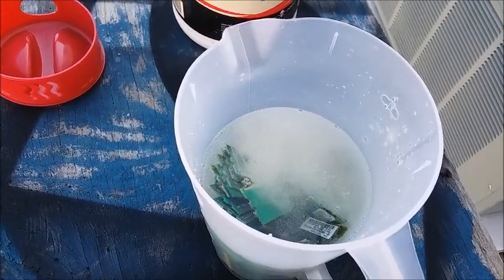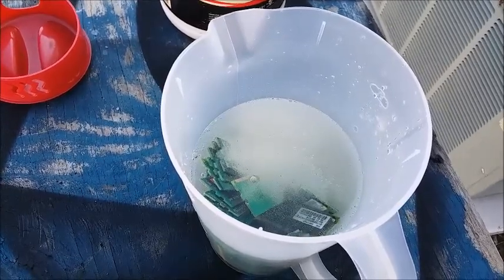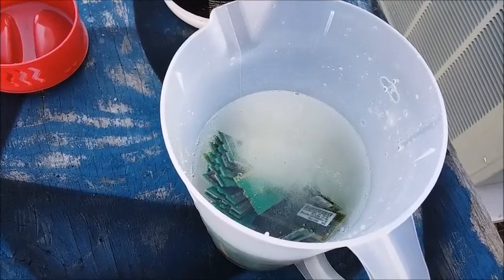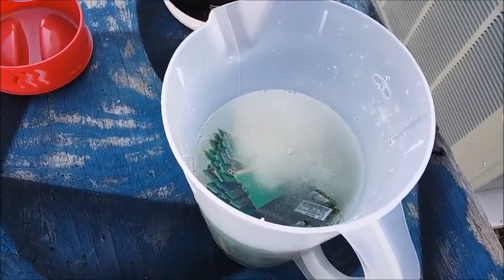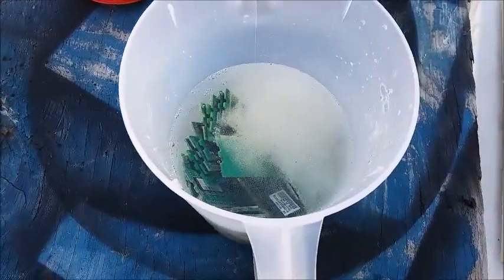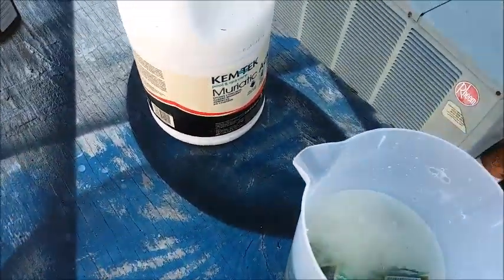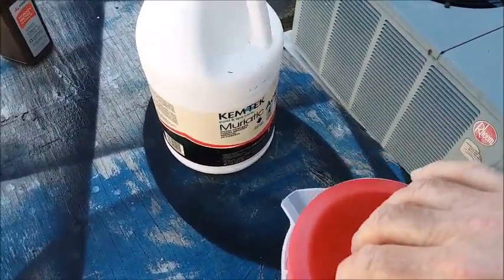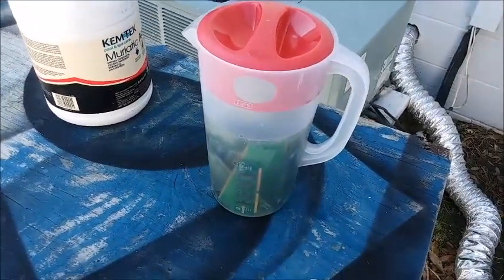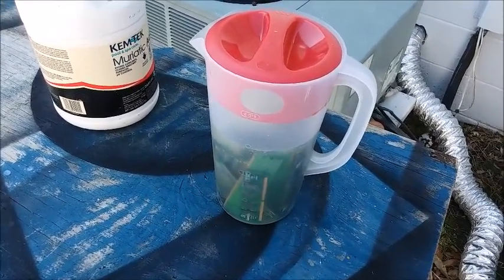The instructions I've seen online say to let this sit for a week, agitated every once in a while — maybe every day or so. At the rate it's going I don't know if it'll take a full week, but we'll see. I'll put the lid on not too tight so the gas that's evolving can escape, and put it somewhere out of the way and let it sit.